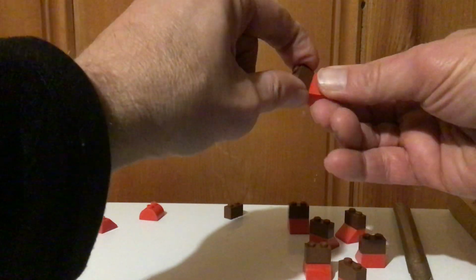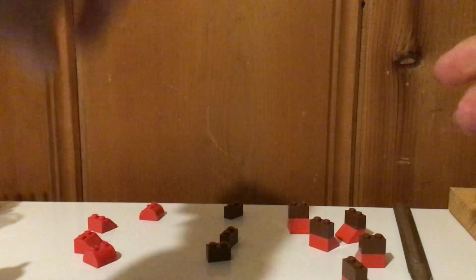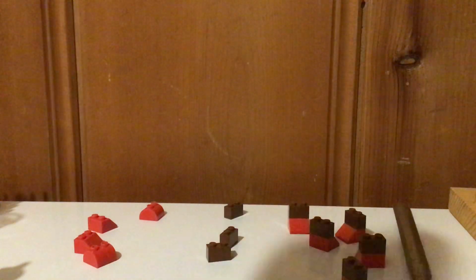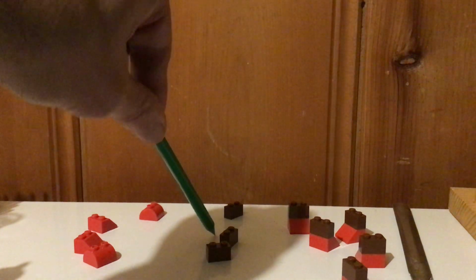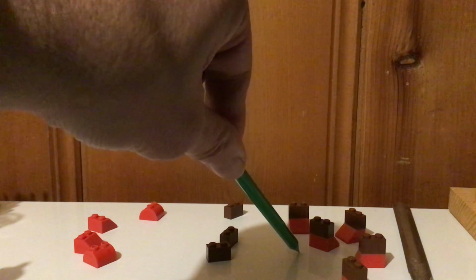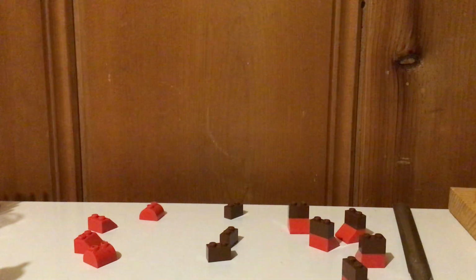Some of the FeSCN plus 2 is going to break up into SCN minus and Fe plus 3. Now it's going to start going back and forth, and we're going to reestablish a new equilibrium. So this decreased, some of it was brought back, the Fe plus 3 increased, and the FeSCN decreased, and that's why it became less red.